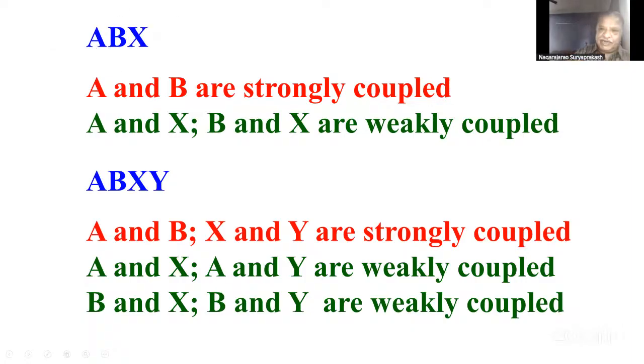I can keep on explaining this for more than 1 or 2 hours. Since the question is for discussion, we have other questions also. I am going to stop it here. But what I'm trying to tell you is that Pople notation is the alphabetic notation of strongly and weakly coupled spin systems, which dictates how the NMR spectrum appears.